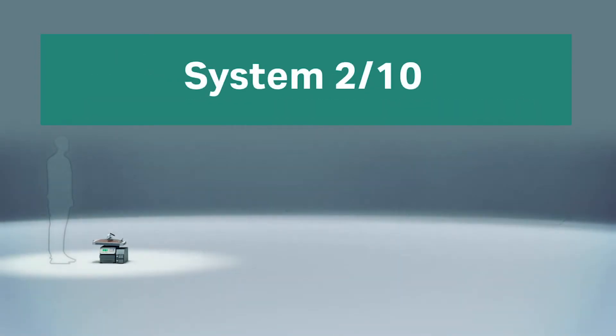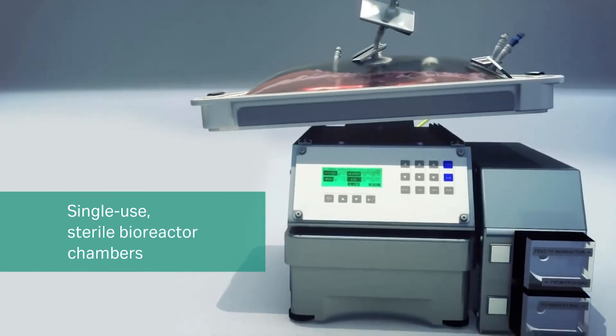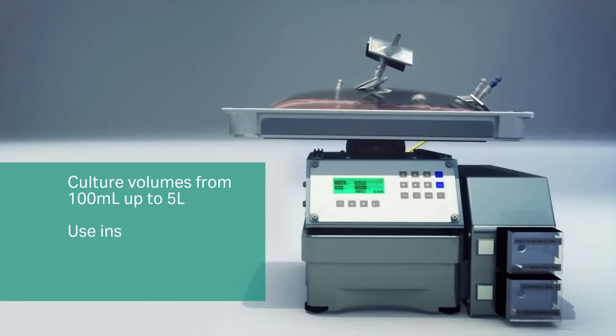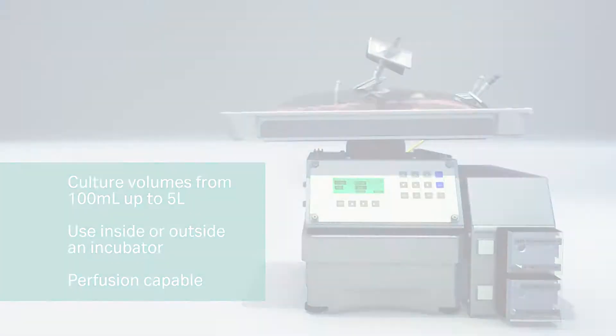The System 210 is ideal for small-scale cell culture. It's simple to use — you can start your cell culture run on the same day as it arrives. The Wave Bioreactor utilizes single-use, sterile bioreactor chambers. It is ideal for research, small labs, and seed train.